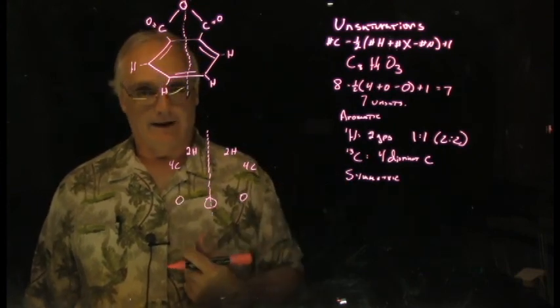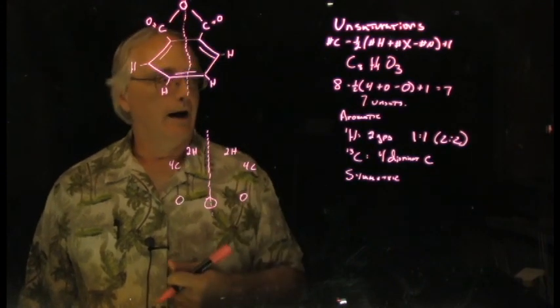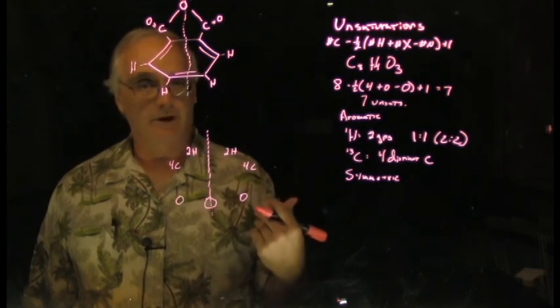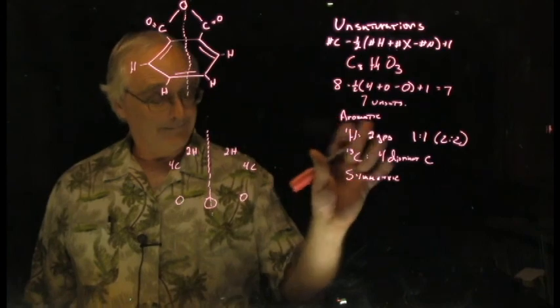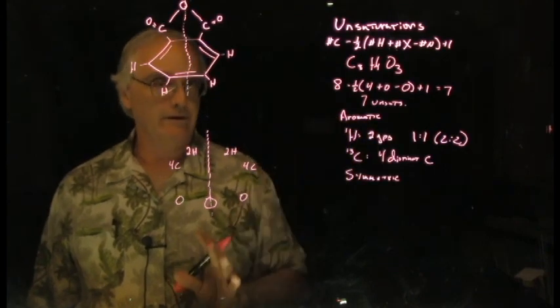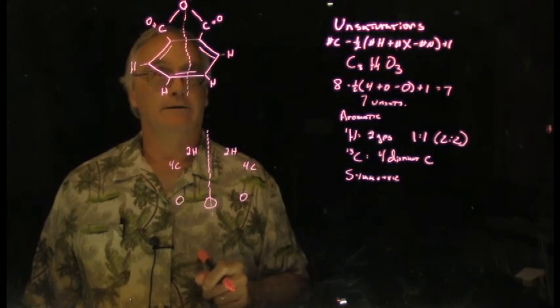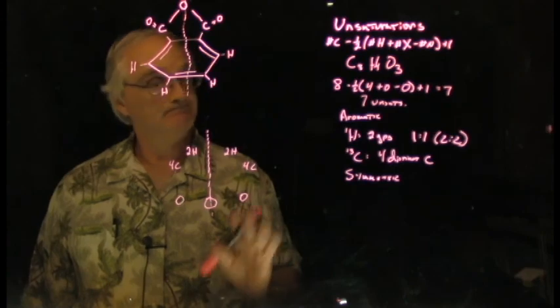We start adding, as we move along, additional layers of interpretation, the chemical shifts, the coupling patterns, and other fancy experiments that we can do in NMR. But you get a lot of mileage out of just groups and integrations. And I hope these 2 examples help make that a little bit clearer. And so keep that in mind and practice a few. Talk to you later.